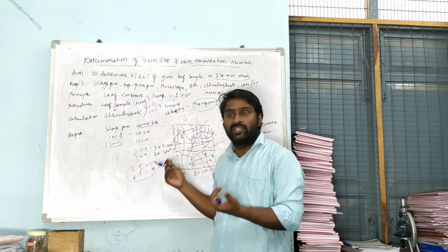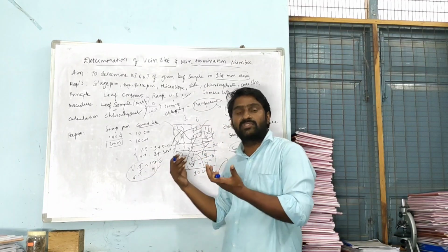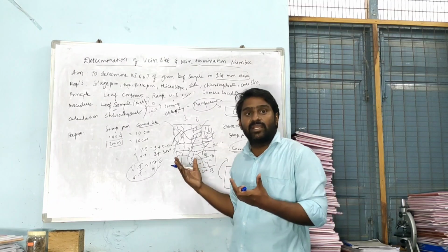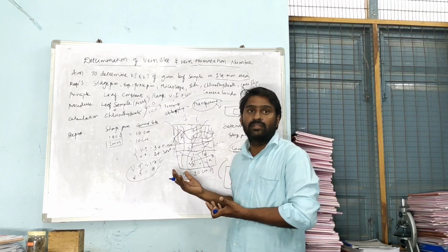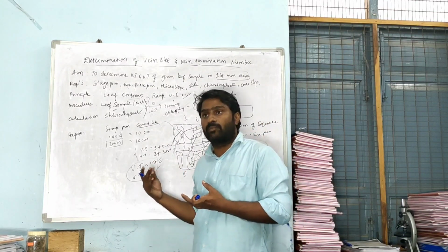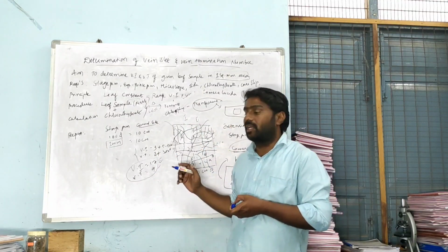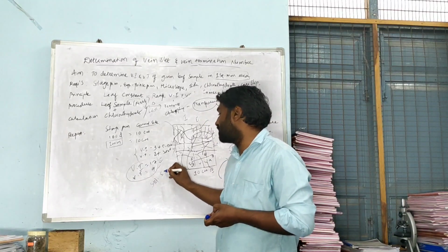Whether the problem is with the tracing, with the identification of vein islets, or with the identification of constituents. If the problem is diagnosed and you repeat the experimental part, you could rectify the errors. At the same time, you could accurately determine the number of vein islets and vein terminates, and compare this with the standard sample.